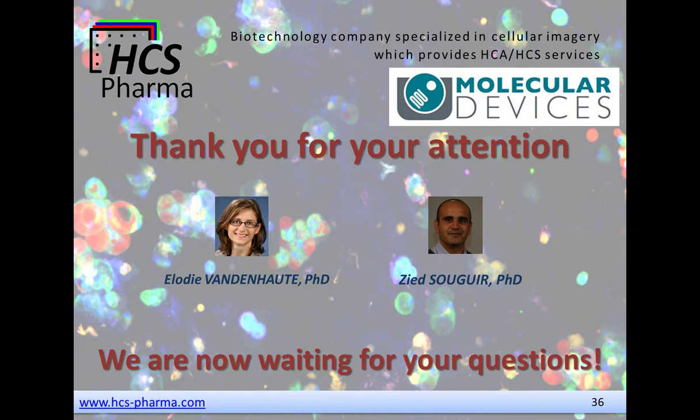Thank you. Okay, the imaging of 3D spheroids showed nuclei only around the outside of the sphere. Have you used any techniques to more fully capture the inside of the spheroids, such as clearing? I think I can answer this. So yes, we've definitely used techniques for tissue clearing.